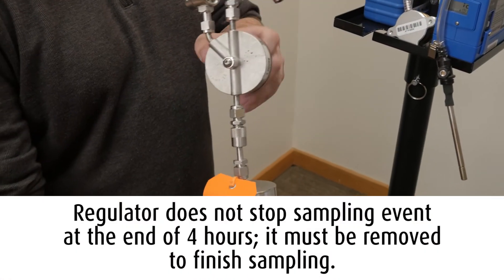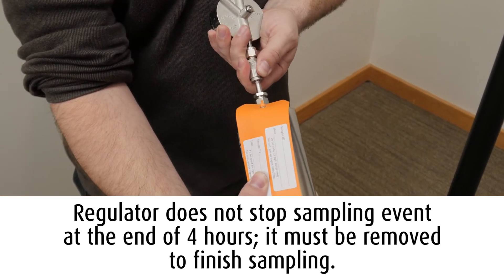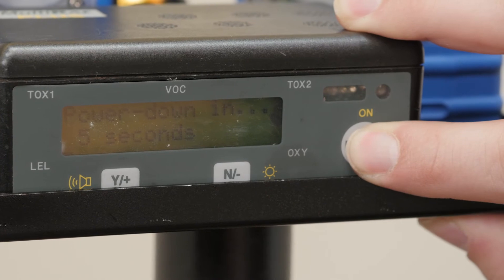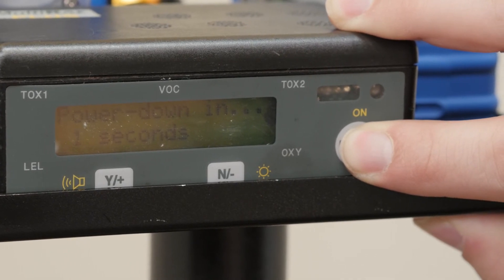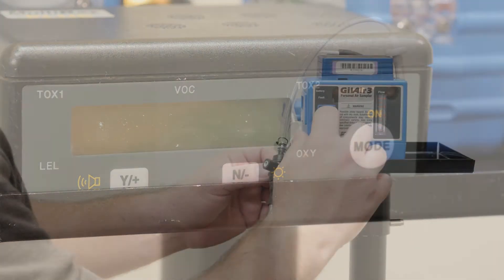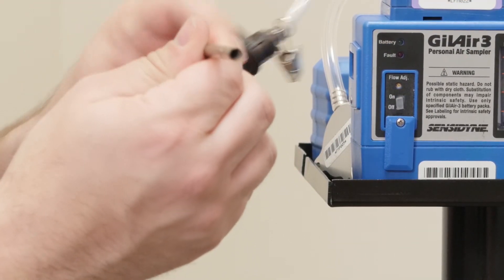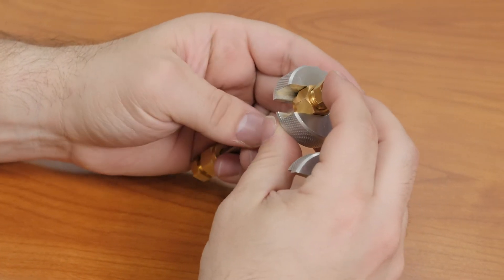Disconnect the MiniCan and regulator. Turn off the carbon monoxide monitor by pressing and holding the Mode button until the countdown ends. The data stored will be reported by SGS Galson in the same report with your analytical data. Turn off the sampling pump and record the stop time on the chain of custody. Remove the thermal desorption tubes from the tubing.